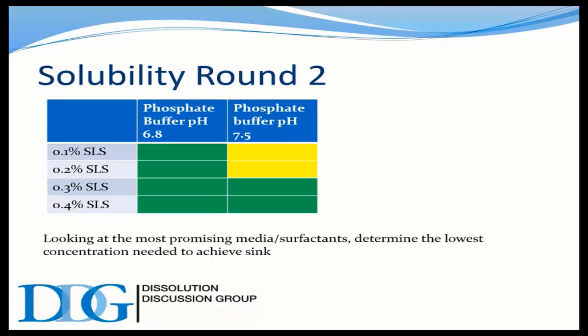Yeah, there probably would be. So you probably run the beginning and end, like pH 1 and 7.5, and then run the 3 pKa, and you might have 7 total, because it's 1 below the lowest and 1 above the highest, I guess. Right, so bracket, maybe. That's a good question.